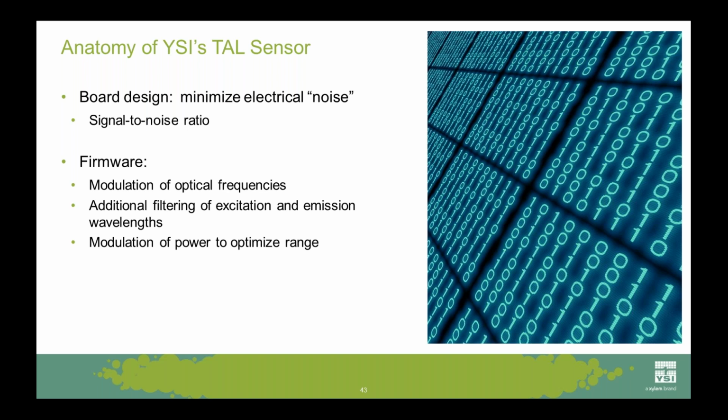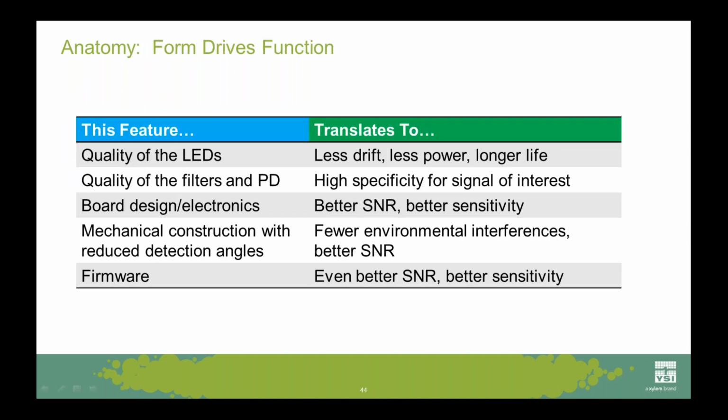Bear in mind that at YSI, every sensor is put together by extraordinary people we have on our manufacturing floor. So we must manually normalize every individual sensor and how the power flows through those LEDs. This is a principle I'll touch on a little bit in the next section when we talk about the importance of calibration. Now, why does all of that matter?